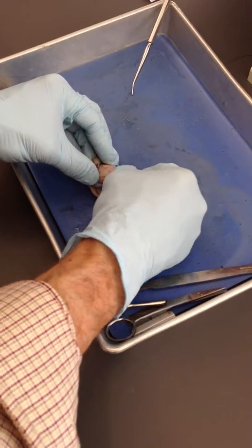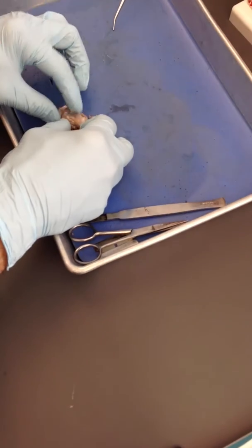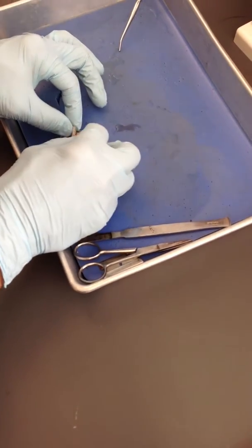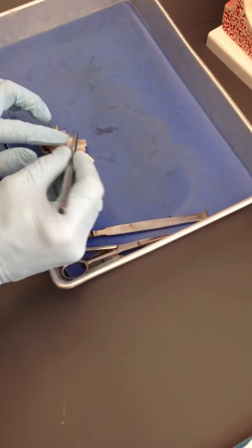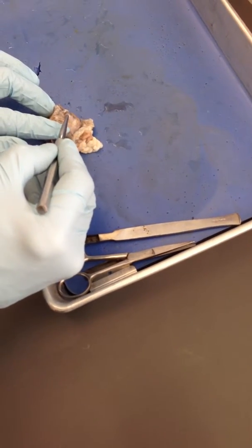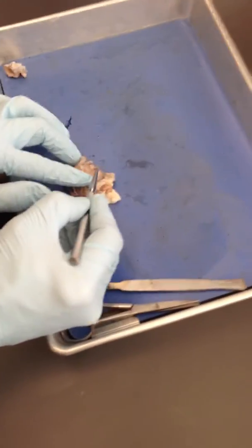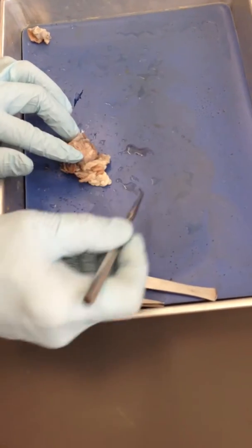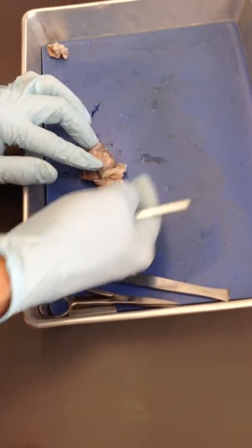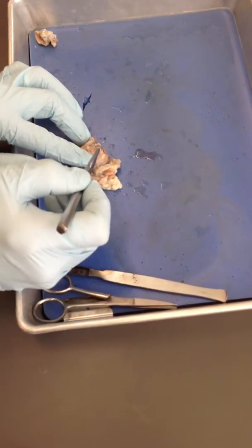Optic nerve is going to be... See, there's a lot of fat here, a lot of fat and muscle. But here's the optic nerve, right there. See that stump? And that is just a bundle of neurons, neuron axons, leading to meet the other optic nerve from the other eye in the optic chiasm, back here. All right, so that's the optic nerve.